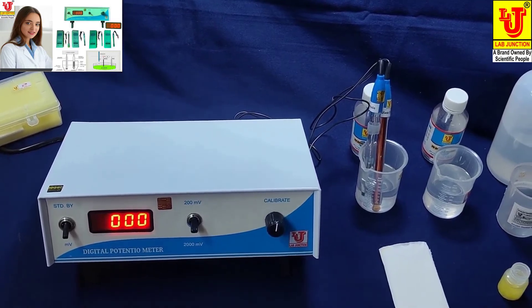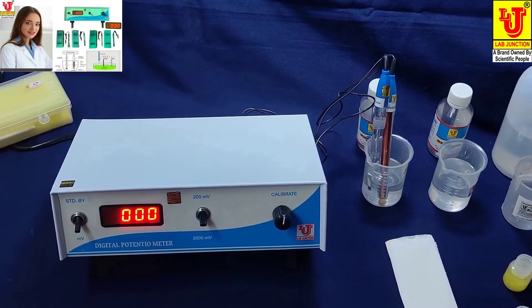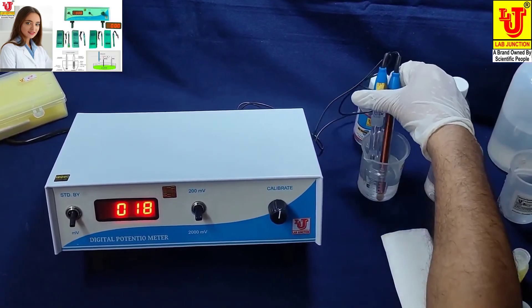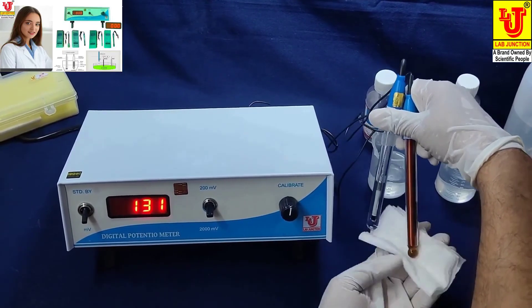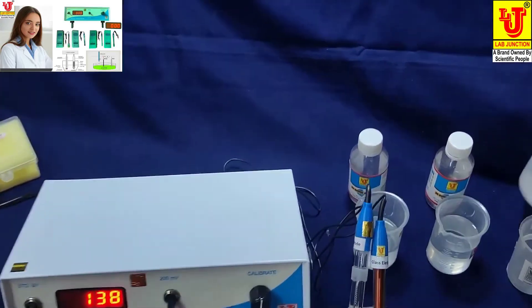Set zero from the calibrate control in pH buffer solution 7 pH. Now the reading is zero. After calibration, refresh both electrodes with tissue paper and then rinse with distilled water.